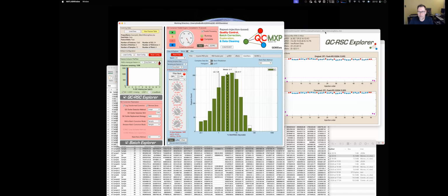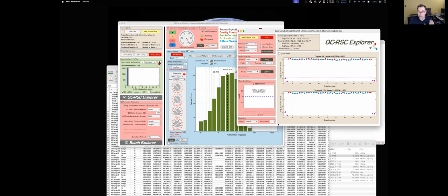But what I would suggest, if anybody in the audience is doing very big studies and wants to use this software and is a bit confused, is to drop me an email, and I'll do a Zoom with you and look at your data with you, and we can talk through it. Because big studies are expensive, and I wouldn't want people to do it wrong. And it does get complicated. I've done 5 or 6 that are over 1,000 samples, and it can get messy, and the quality of the data can get really poor, unfortunately.